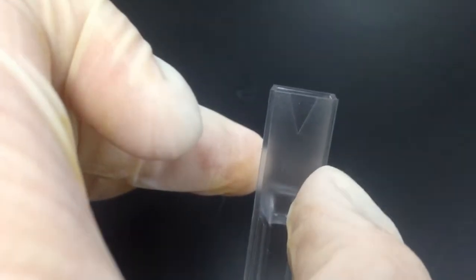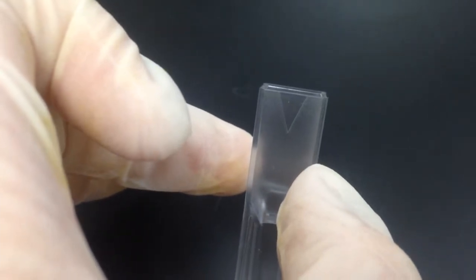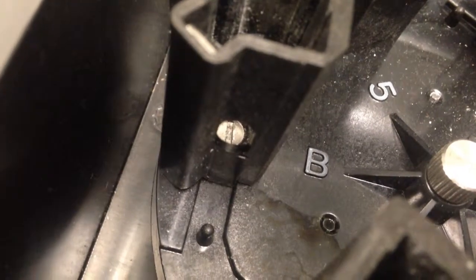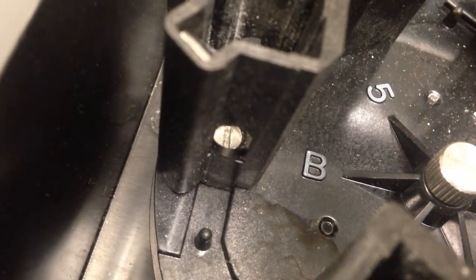Load the cuvette into the machine by aligning the triangular arrow in line with the opening in the machine. This is where the wavelength of light will pass through.